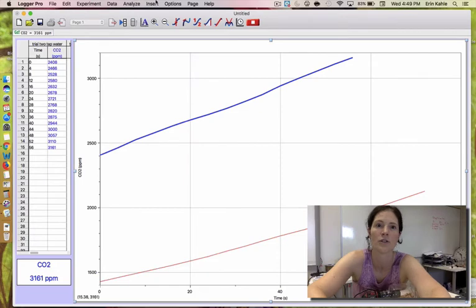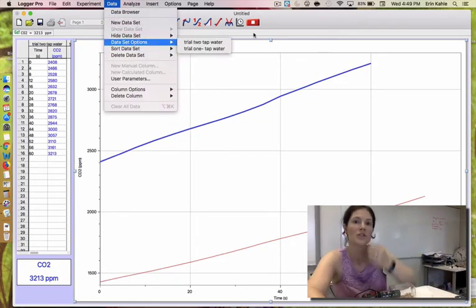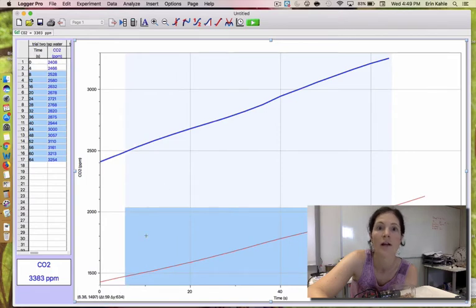And that should save that one. So I'm going to stop this one. And let's say that I want to find out what was the rate of cell respiration. So I'm going to try to find, and honestly, I'm just going to pick the whole period of my graph here. There's tons of different things that you can do. You can find, if your curve was changing, I think this sets tangent line. But the one that you're probably going to want to use the most is the linear fit.